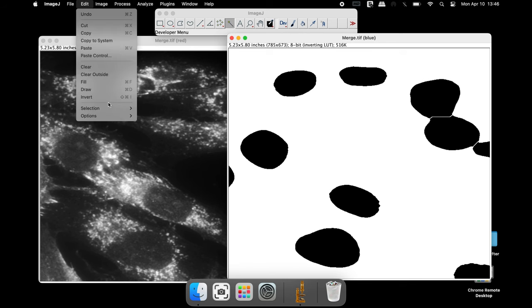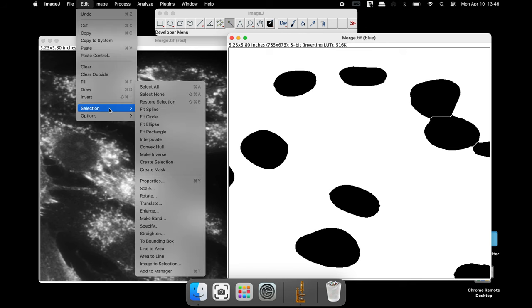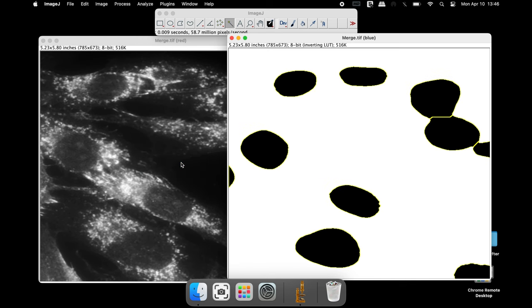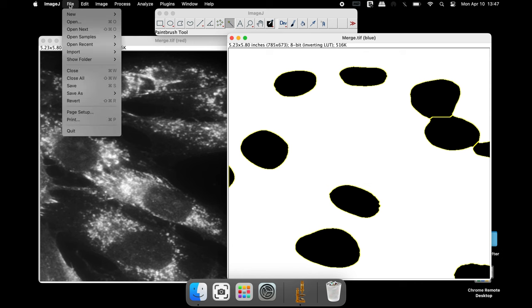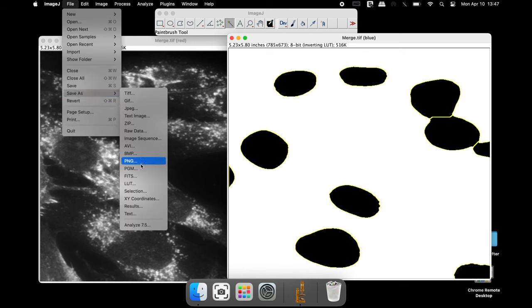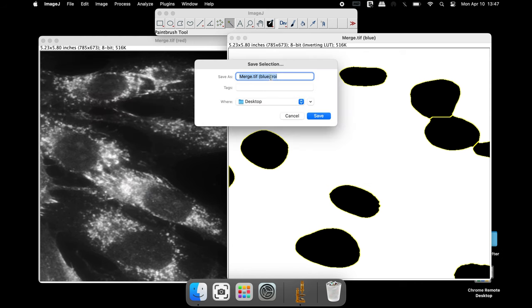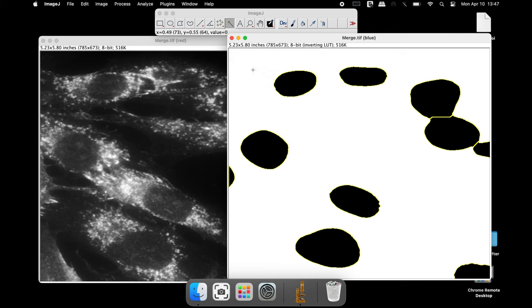Select all the nuclei by clicking on Edit, Selection and Create Selection. Save this image as Selection — rename the file and save it with a .roi extension. Now this window can be closed.